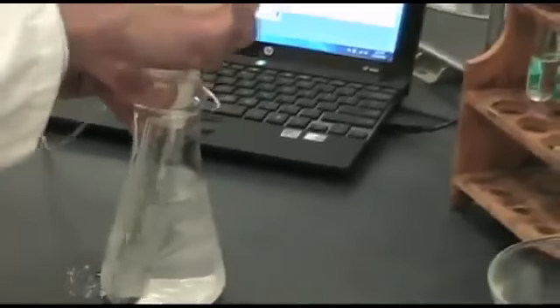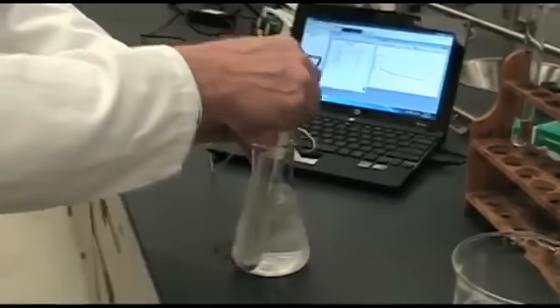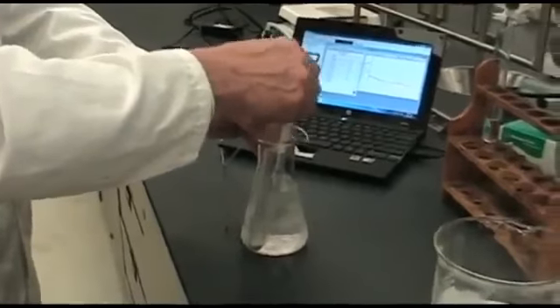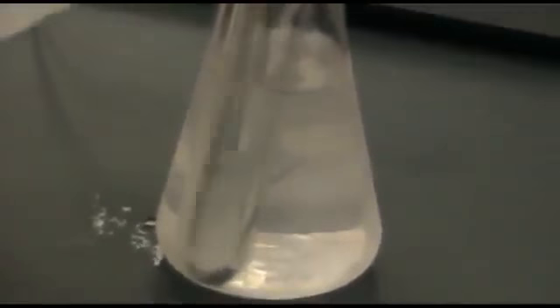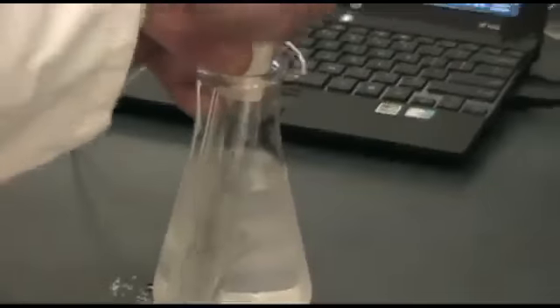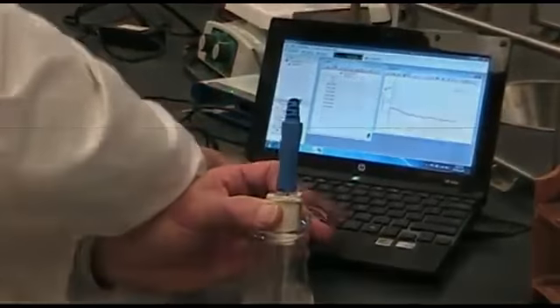So while I'm stirring it, I'm imparting some energy to keep it thawed, but eventually my stirring can't keep up with the cooling. So I'm going to go until the 10-minute mark here on the computer. It's another 10 seconds. So that should give us a good freezing point depression. We've got it quite constant there between -3.9 and -4. And we'll stop it there.